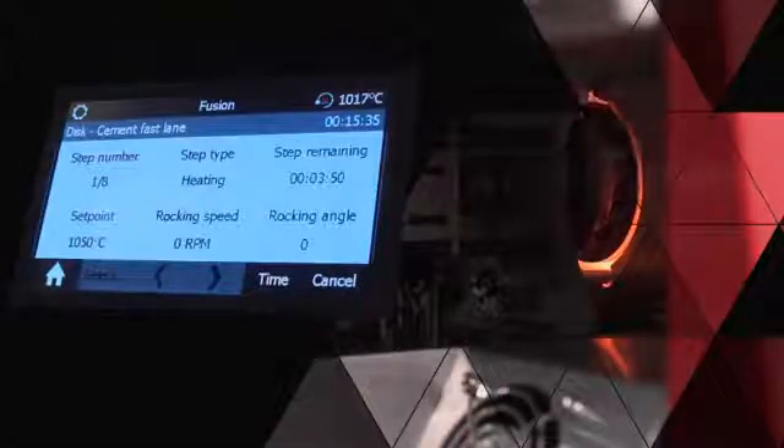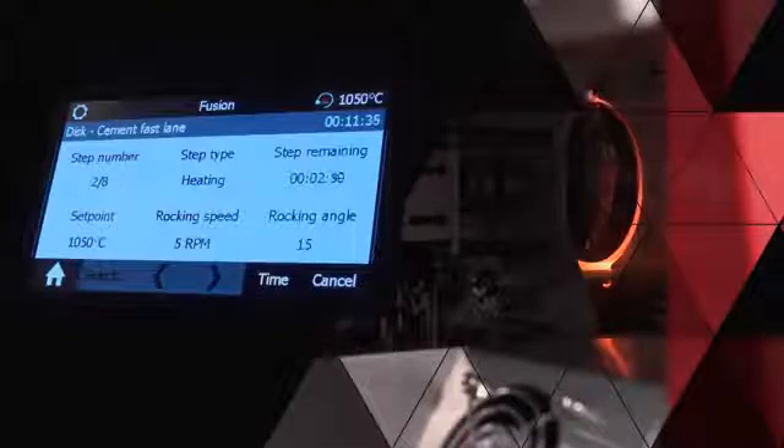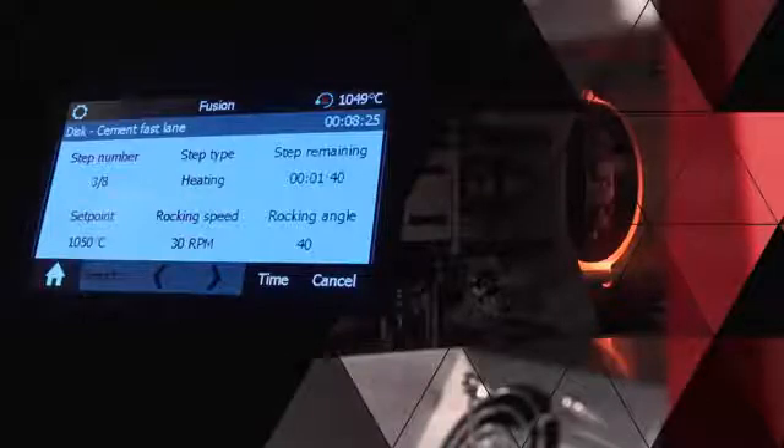Powerful and flexible, the NIO Fusion Instrument heats up to 1200 degrees Celsius and allows precise temperature control and monitoring to plus or minus 1 degree Celsius, thus ensuring high analytical accuracy and fusion success rate.